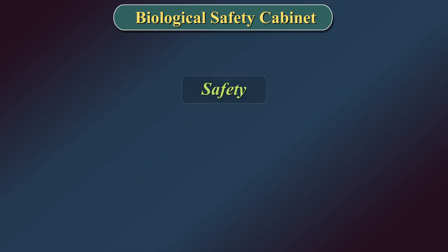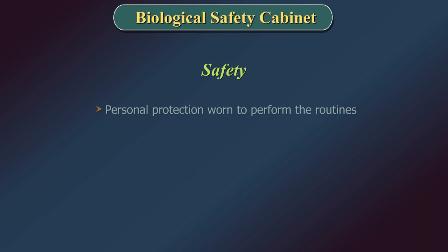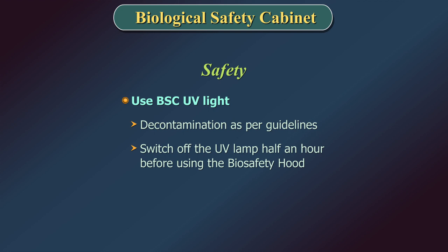Safety: The maintenance of internal components must only be done by trained and qualified personnel. Decontamination must be done prior to carrying out maintenance on internal components. Personal protection must be worn to perform the routines. Use the biosafety cabinet UV light for decontamination as per guidelines, and remember to switch off the UV lamp at least half an hour before using the biosafety hood.